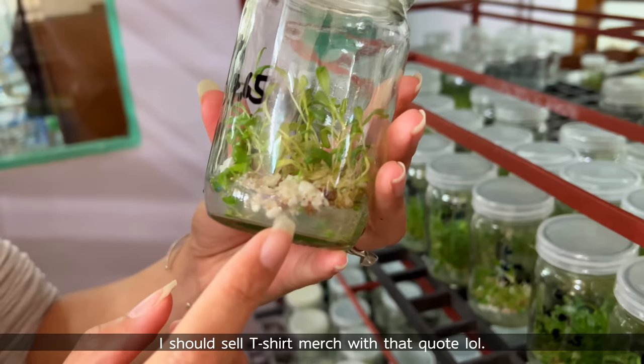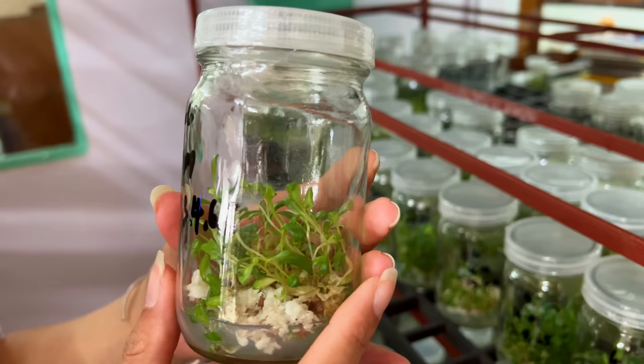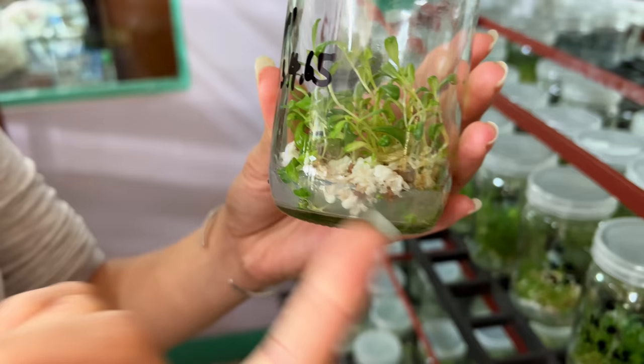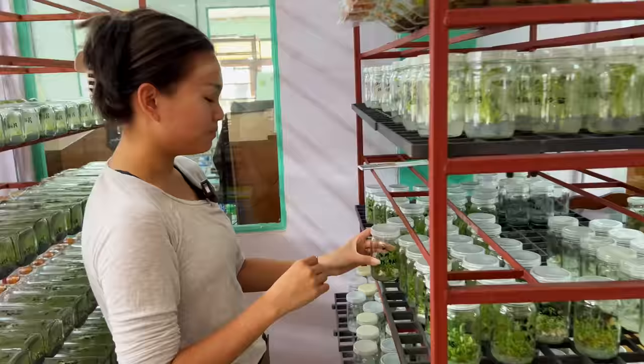These are — I think — White Princess. They look like little mini greens. These little things are a bunch of cells. You see those little buds? Those could become 40 or 50 plants from here. And then you would keep separating them. We have White Princess, Pink Princess, and others.